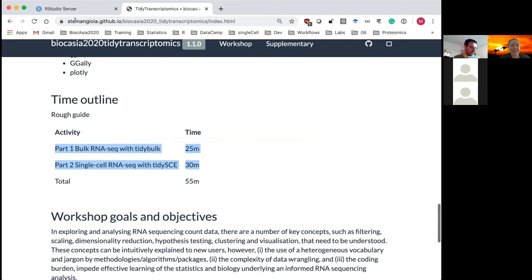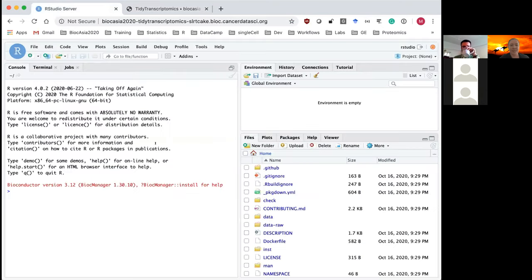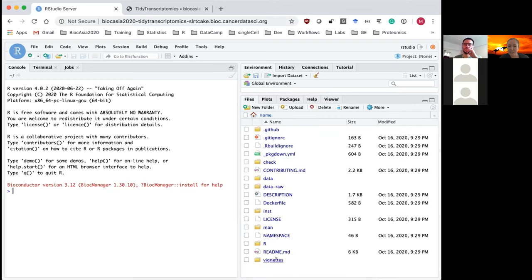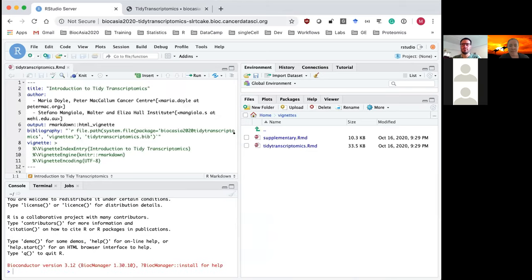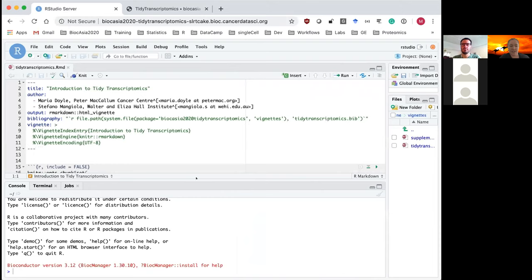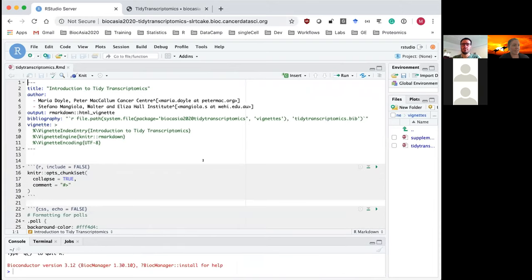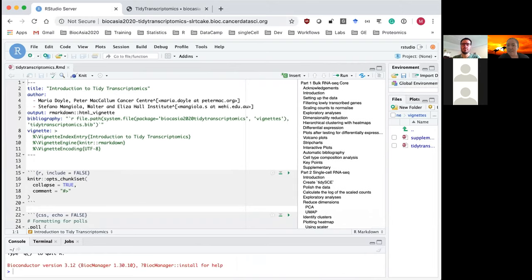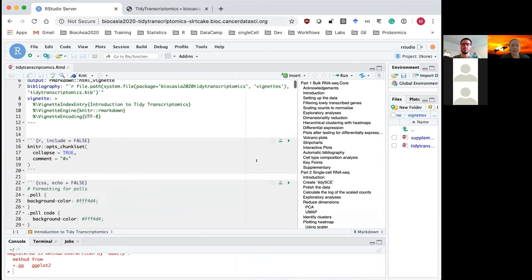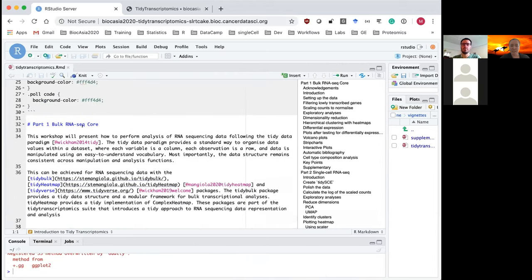Hopefully most of you have your RStudio Cloud launched. In my version, everything is launched in the cloud. In the Files pane there is a vignettes folder — that's the R Markdown document we'll be going through today. Click on that to open it. I'm going to click the button that opens the sidebar so you can see the different sections we're going through.